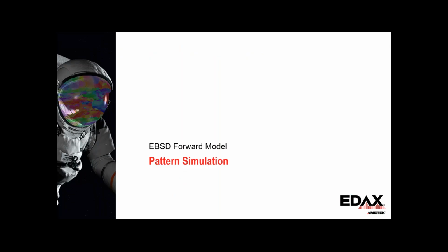So we know that there's a benefit to doing the forward modeling, and the question is, how do we do that for EBSD?